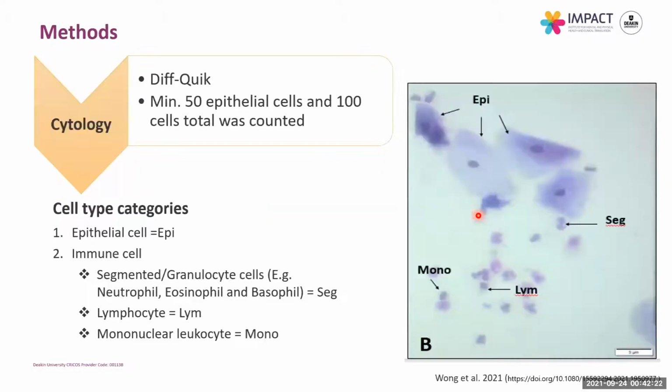After the collections, the samples were smeared on slides, and the slides were stained using Diff-Quik as detailed elsewhere. All slides were de-identified and analyzed by 2 observers. Counts were used if the discrepancy between observers was less than 10% of the count for each cell type.